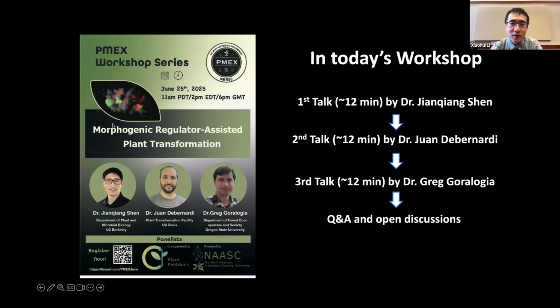Okay. The next question is also about chimeric transformants. So does keeping the callus on selection media for a long time, like two to three months with subculture every four weeks, reduce the number of chimeric transformants?